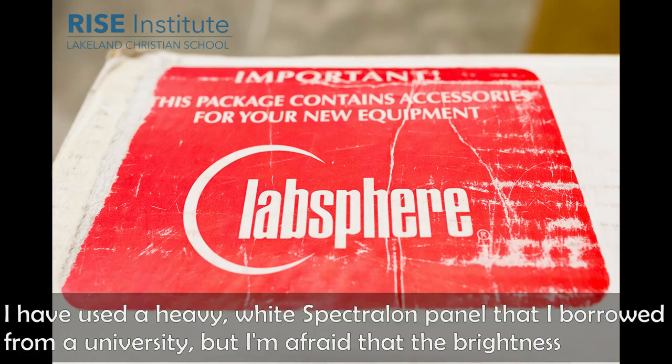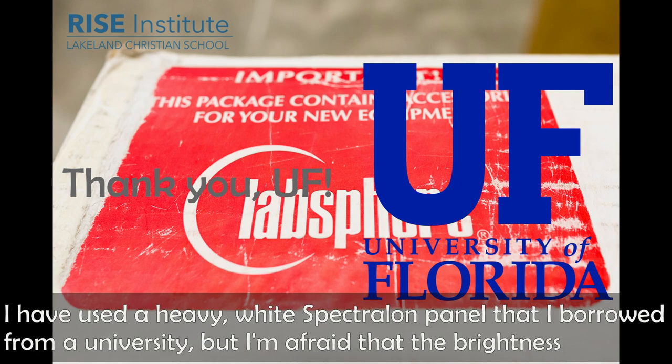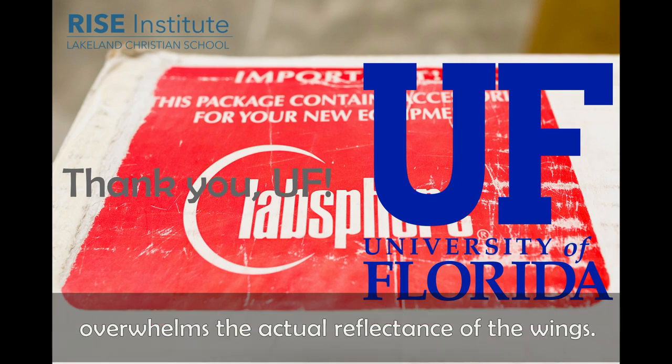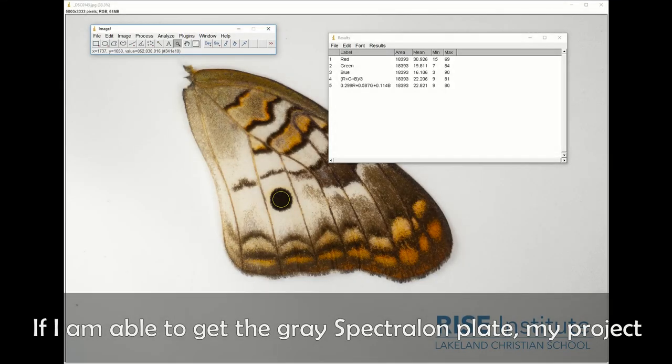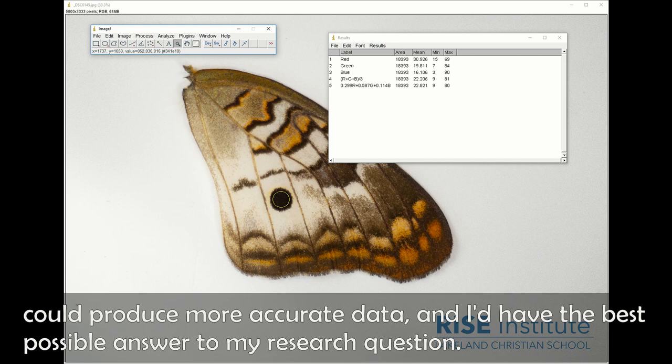I have used a heavy white spectrolon panel that I borrowed from the university, but I'm afraid that the brightness overwhelms the actual reflectance of the wings. If I am able to get the gray spectrolon plate, my project can produce more accurate data and I can have the best possible answer to my research question.